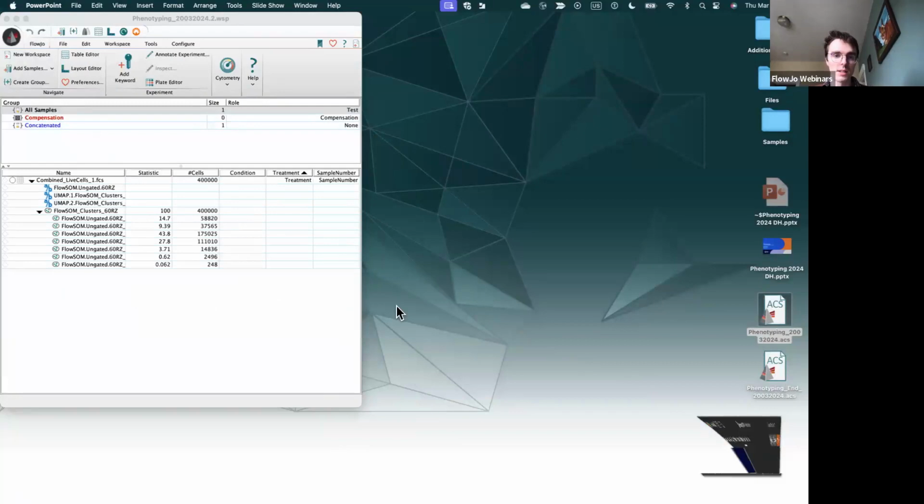So I did notice there's one other question in the Q&A that I see, and it's questioning if it's possible to automatically annotate the clusters. MEM is the closest thing we have where it automatically annotates the expression. But there's so much variance in what the expression from different cytometers looks like, with the magnitude or the range of intensity values. Depends on stains too. It's really hard to use a machine learning algorithm, for instance, to automatically annotate clusters. It also depends on how people are naming their stains and what markers they're using.